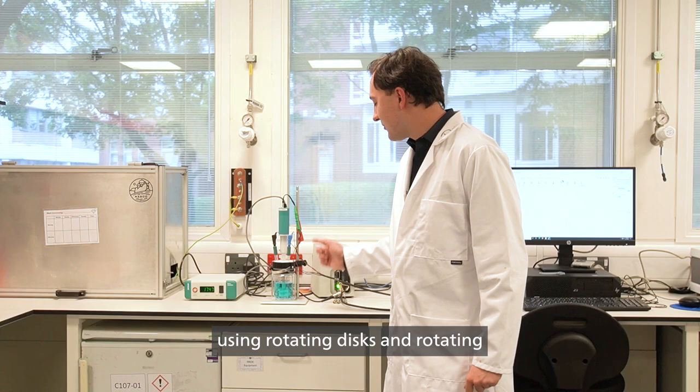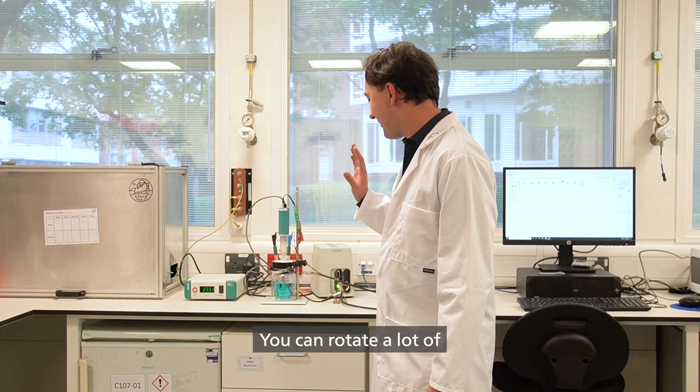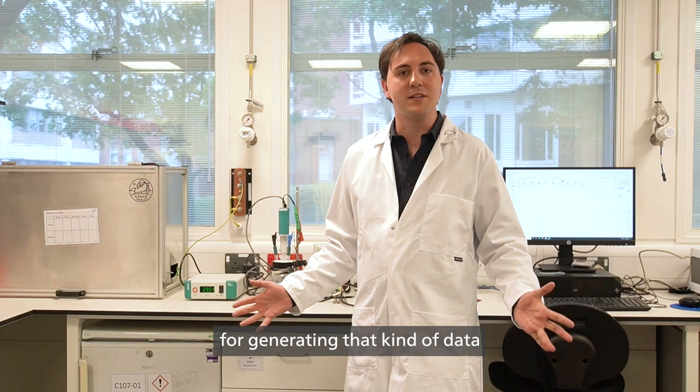I do energy research using rotating discs and rotating ring disc electrodes. The Autolab rotating disc electrode is excellent due to having the mercury contacts at the top. It's dead silent, it can rotate at a lot of rotation speeds, which is particularly useful for generating that kind of data without noise from mechanical motion.